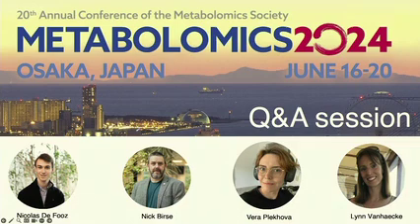One to Nicolas. You showed the retention time, which then probably translates to acquisition time because there is no retention involved. Are they reproducible? If you have a sample and something is acquired early in the next sample, is it as early or is it later?